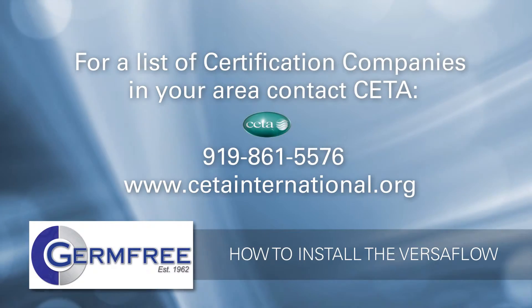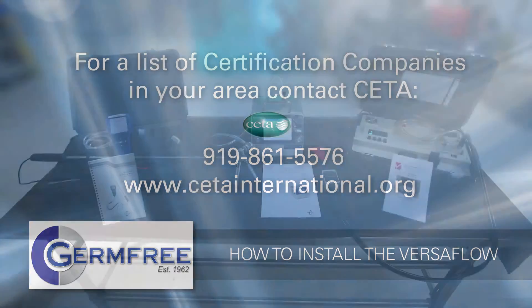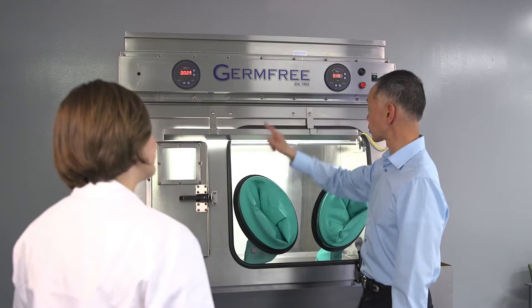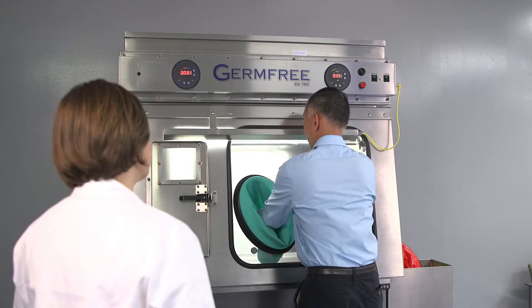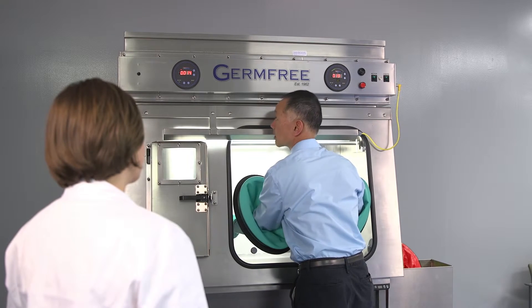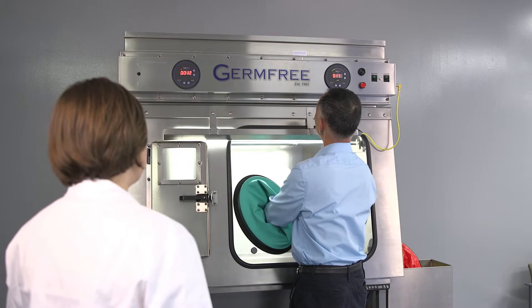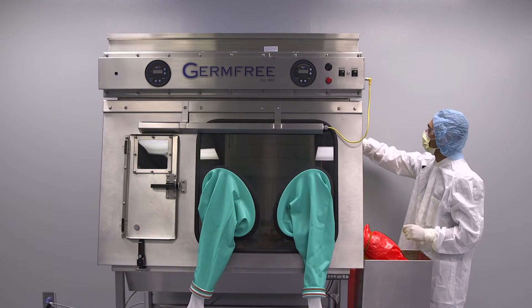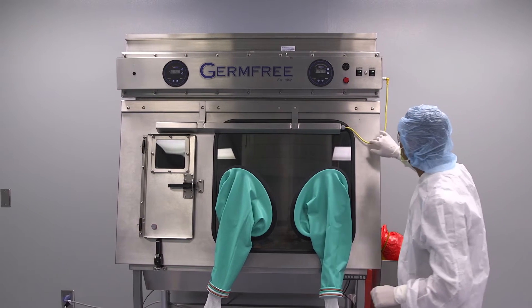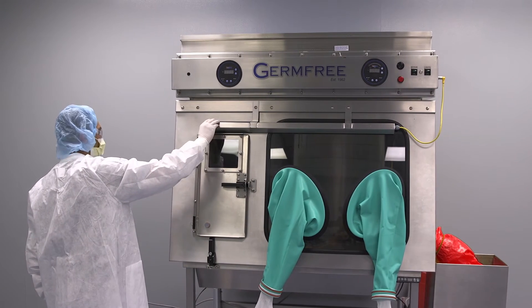Certification of your Versaflow must be performed by a company that has the proper equipment and training needed to test and measure HEPA filter performance. It is always a good idea to familiarize yourself with the basic operation of your new Versaflow. Certification company personnel are very familiar with this type of equipment. Certification should be completed semi-annually or as your state or local regulations dictate. Your organization's standard operating procedures may also require periodic certification.